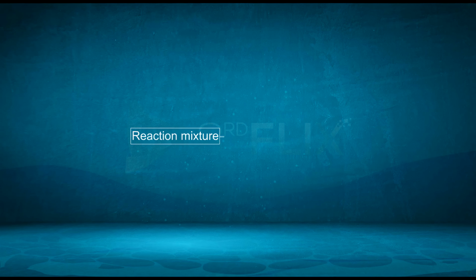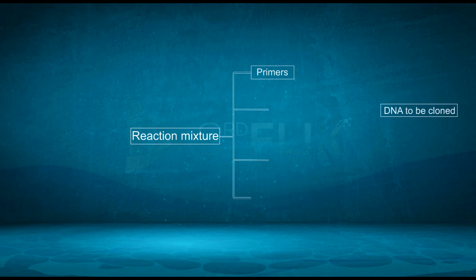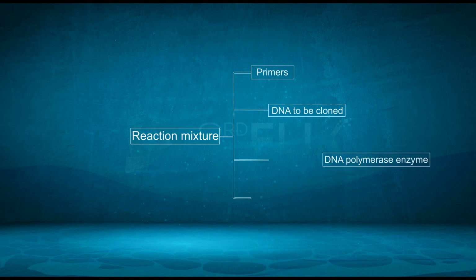The reaction mixture contains primers, DNA to be cloned, DNA polymerase enzyme, and dNTPs.